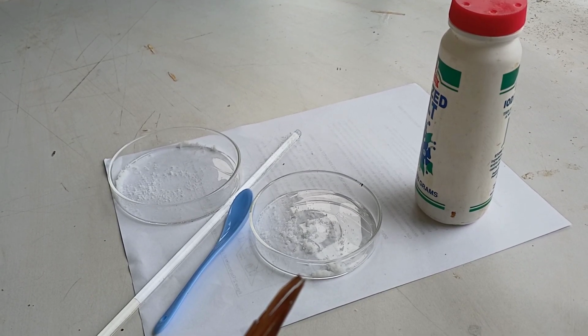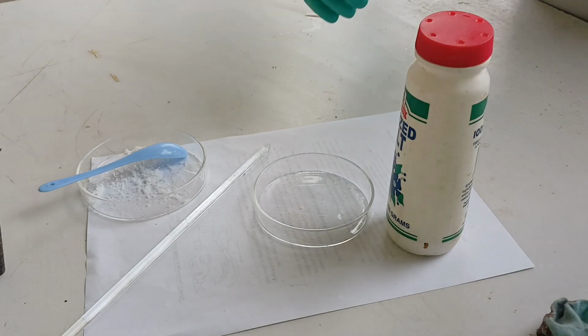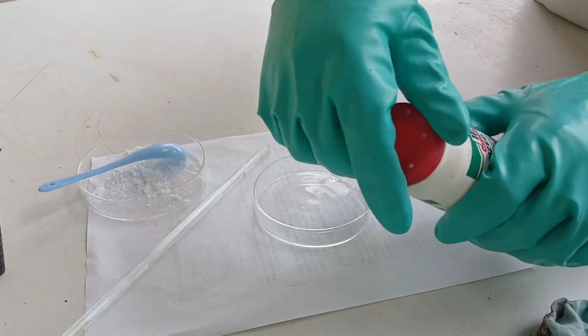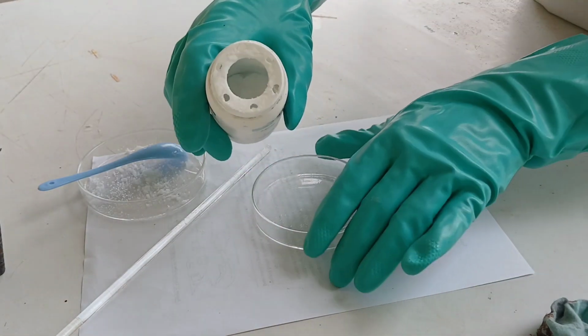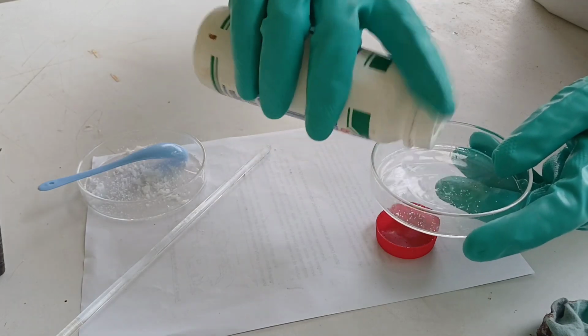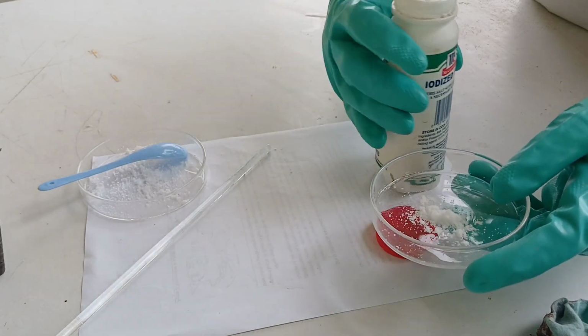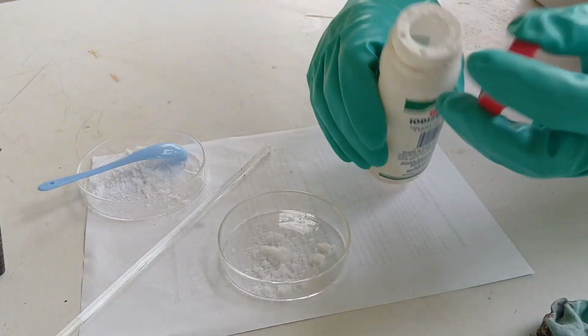Actually, you need to master that one, and we have a lot of ways, strategies, and methods to transfer solid chemicals. The other method is just like this. As simple as this, just open the container of solid chemicals with the use of your hands. Since it is an open mouth container, a reagent bottle, just tip using your fingers. It's just tipping, gitak-tak lang siya using your fingertips.